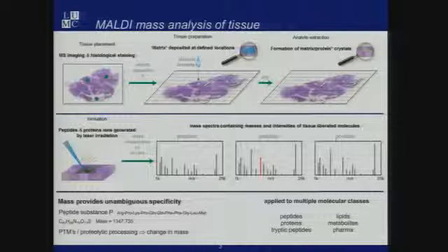And so we have these matrix crystals here. This is the MALDI matrix. When we shine a laser on this analyte-doped MALDI matrix, we generate these biomolecular ions. Of course, we've deposited these solutions at a very small defined region, so the molecules present in this analyte-doped matrix crystal are a representation of the biomolecular content of these positions.